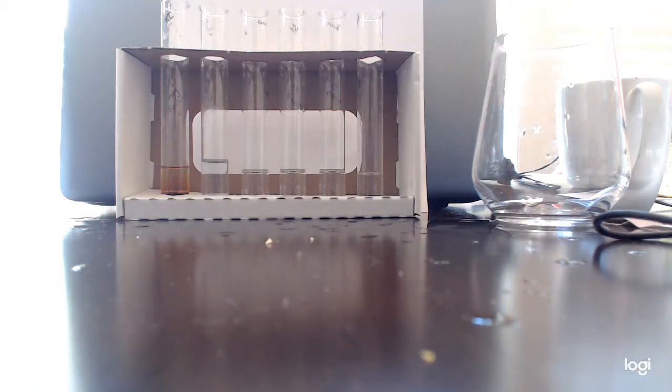That's our protein test. And remember, our last test is the Benedict's test. Can you think for 1 second what molecule the Benedict's test tests for? Okay, if you're thinking sugar, that's correct. 20 drops. All right, so 20 drops of our Benedict's test.